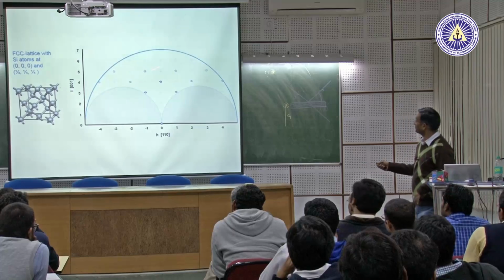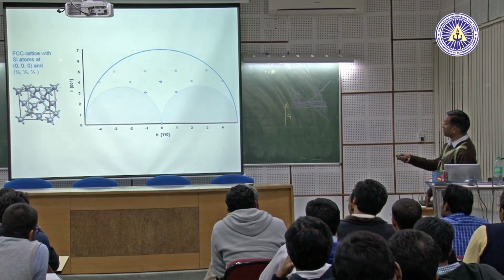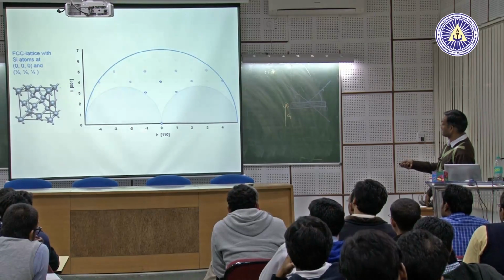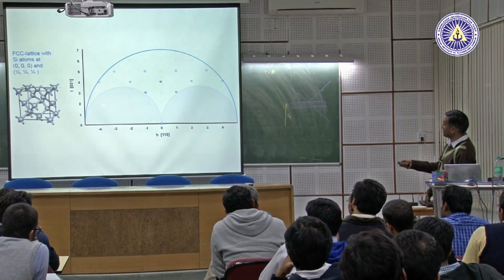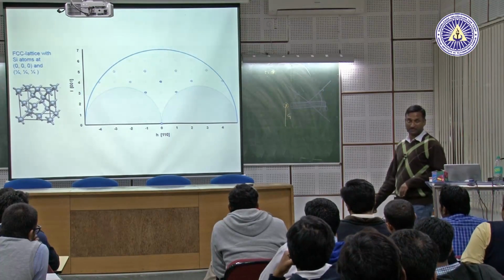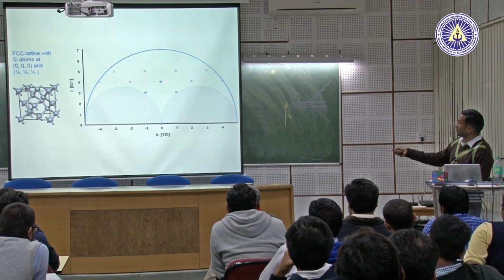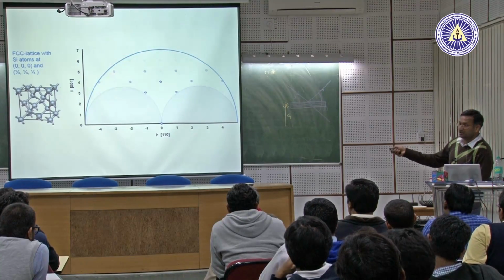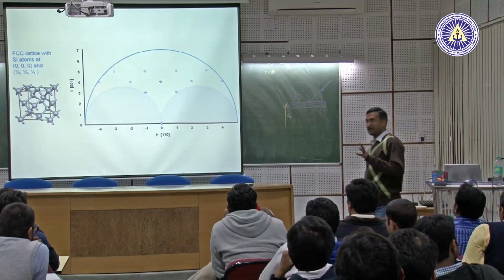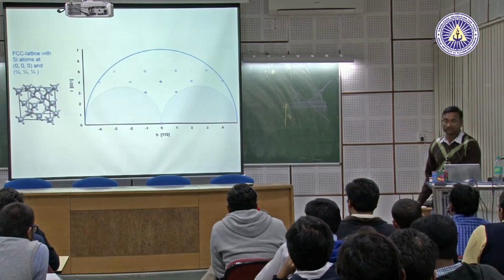For this particular orientation, where your x axis is the 110 direction and this is the 001 direction, you only have a handful of spots to look at. So your beam orientation has to be set with respect to diffraction achieved for these spots, ensuring that the Ewald sphere radius is smaller than the radius of this great circle.